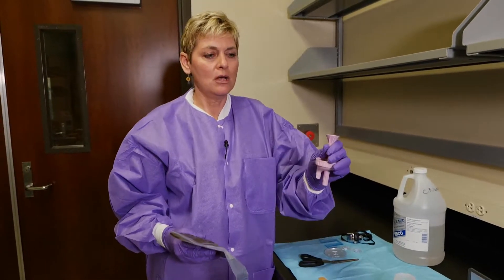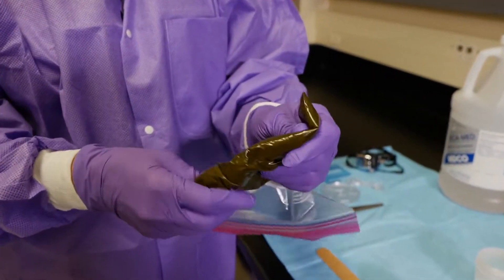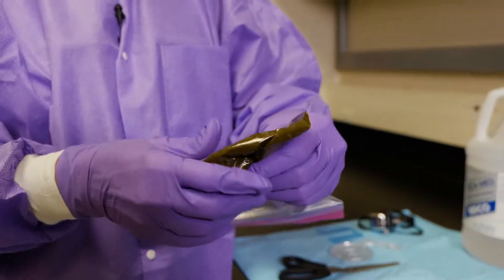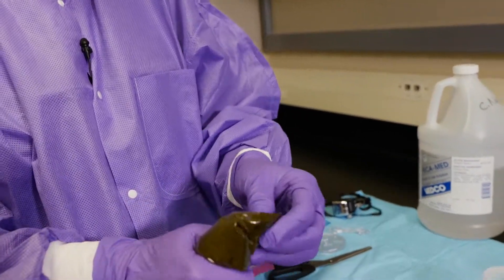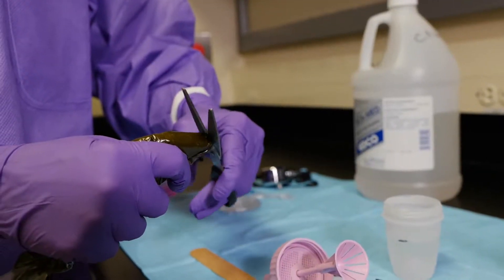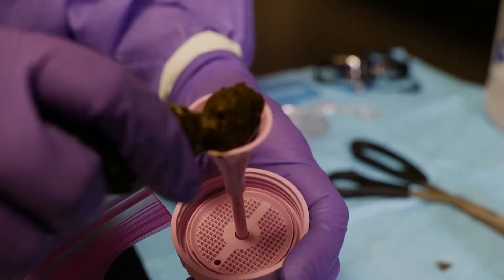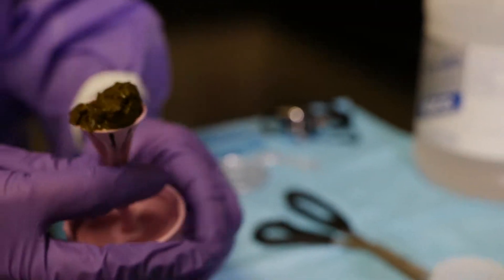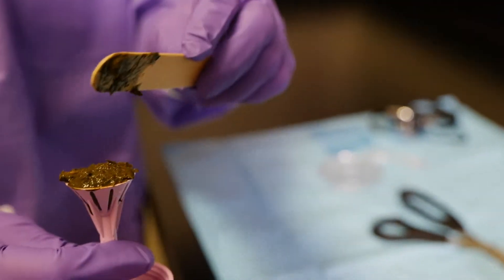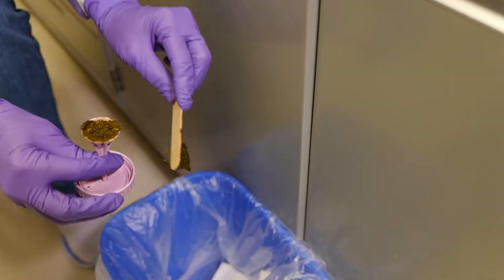The next thing we're going to do is fill the flowtack. This is a fecal sample from a cow, and what I like to do is mix these up so that it distributes the eggs a little bit better. One thing I learned is to just use some scissors to cut the tip off, and then you're going to fill this flowtack. Fill that up, then tap it down, and then scrape off the excess so that it's level.